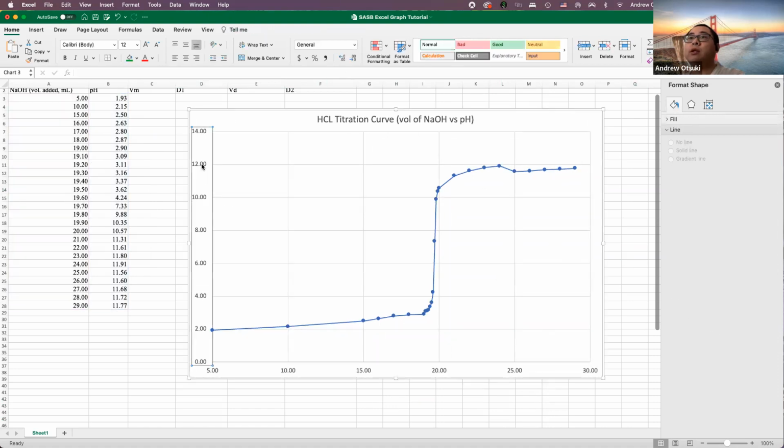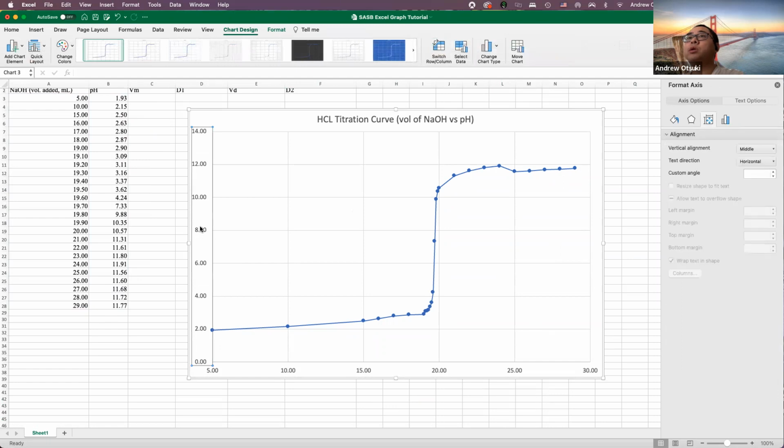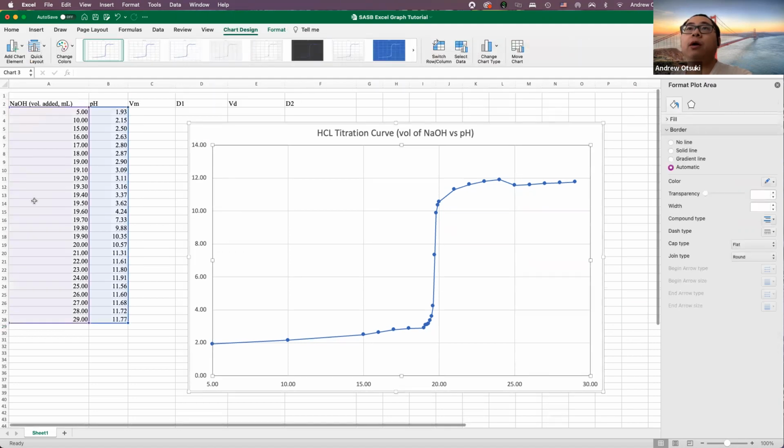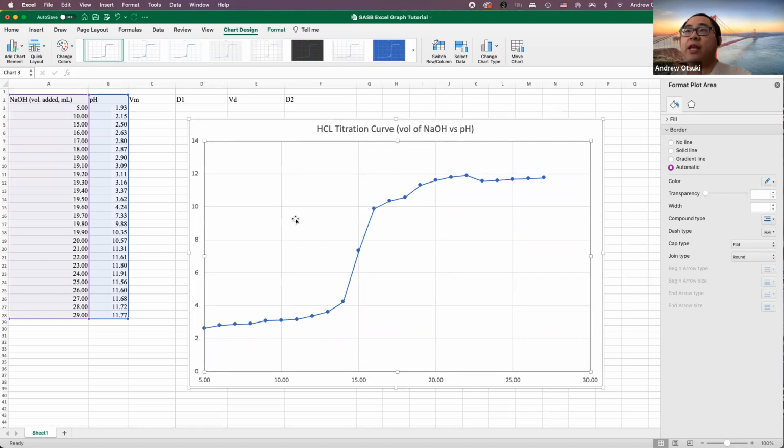Okay. So let's edit our y-axis. We should give it a label. If I could figure out where it goes. Okay, labels, axis options, text options, text fill. Huh, I forgot how to label it. Let's see, axis values in reverse order, labels, doesn't really say. Oh, I see. We should probably highlight this value too. So when we're making a graph, let's make sure we highlight the name.